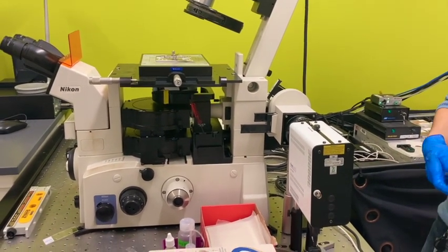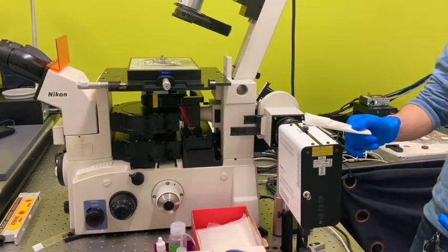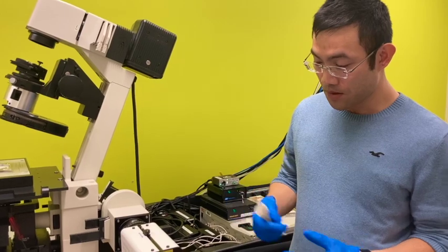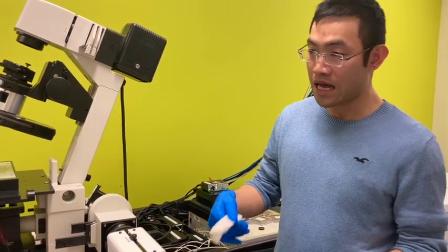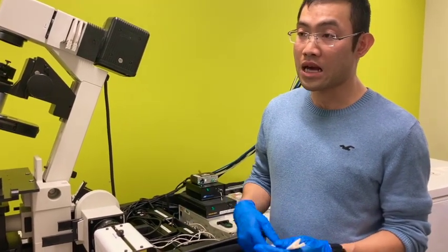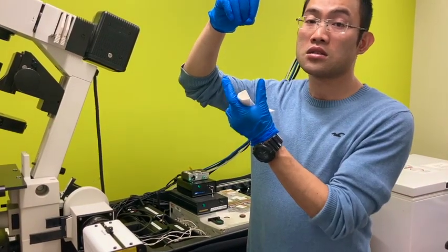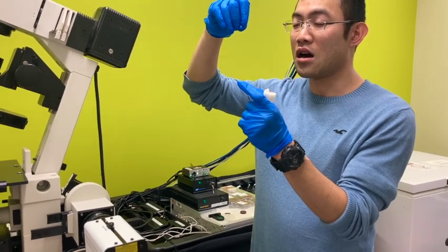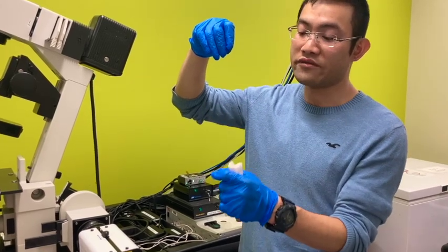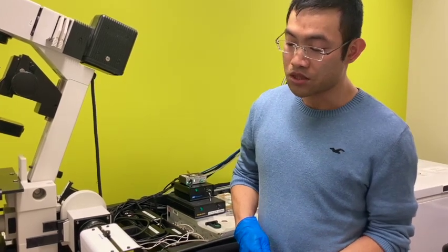And we use different lasers to excite different dyes, and also we use this for IRM. Generally speaking, the shorter wavelength for the IRM is better for contrast, because our IRM signal is from the scattering of the particle. So the shorter the wavelength, the higher the scattering. So we have more signal from a shorter wavelength, which is our blue.